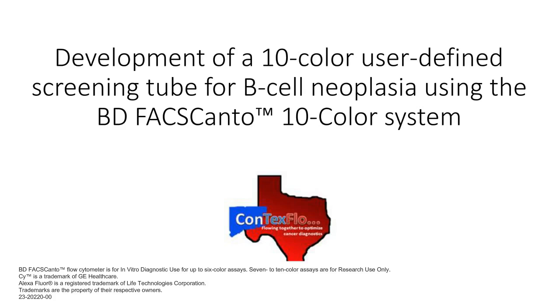Thank you, Alan and Joe. We have another question from Arun. He says, hi, we faced a lot of difficulty in the kappa lambda tube with nonspecific and background staining. Do you recommend any particular method in sample prep for the kappa lambda tube? I think this is a great question, and if I could ask Joe to answer it first, and then Jeff, if you would follow up with what you do in your lab.